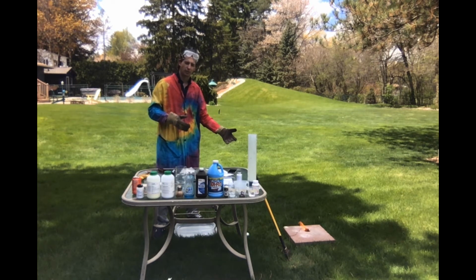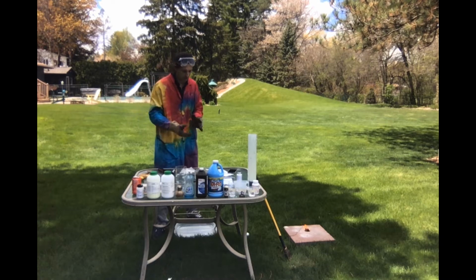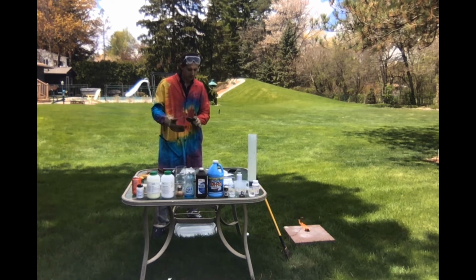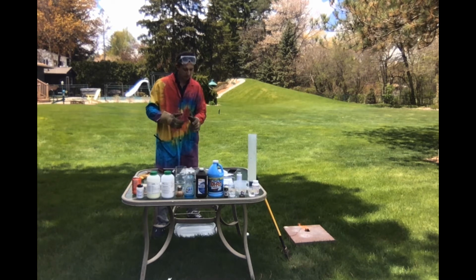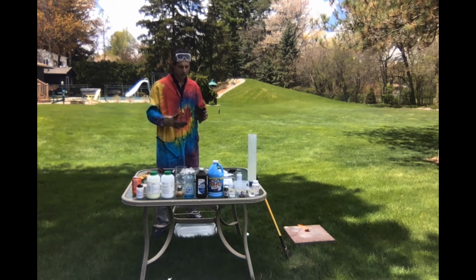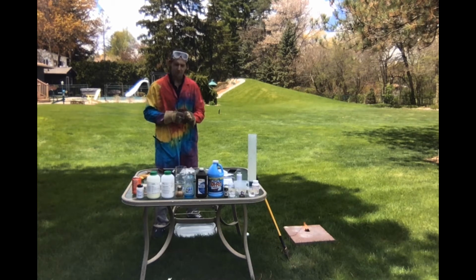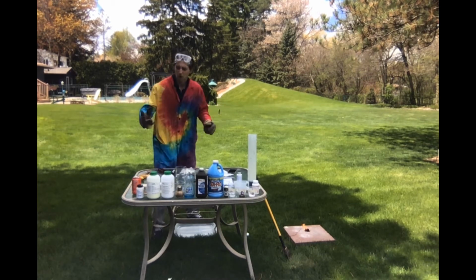The smoke is a product, the flame is a product, and therefore it's a chemical reaction, okay? What my final claim would be, based on the substance changing its color, texture, shape, and releasing a smell, smoke, flame, and turning into a different substance, ash, is that this is a chemical reaction, all right? Chemical reaction.